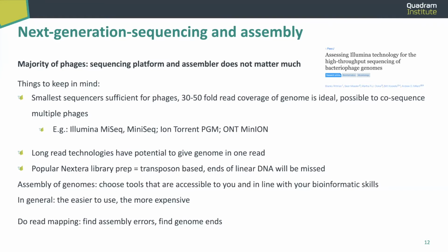When it comes to assembly of genomes, it is important to choose tools that are both accessible to you and in line with your bioinformatics skills. Now, this is sometimes a bit of an issue because the easier to use, the more expensive they are. So what we will show you today is all based on freely available software, but then it is more tricky to get started.